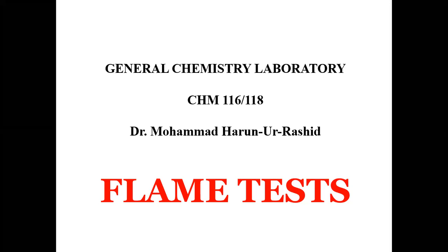So just by controlling the flow of air, especially the oxygen, into the burner, we can create the luminous flame, which has a reddish or yellowish color with a less hot flame. Sometimes this flame is also called the safety flame because we can easily identify the existence of the flame because of its color.